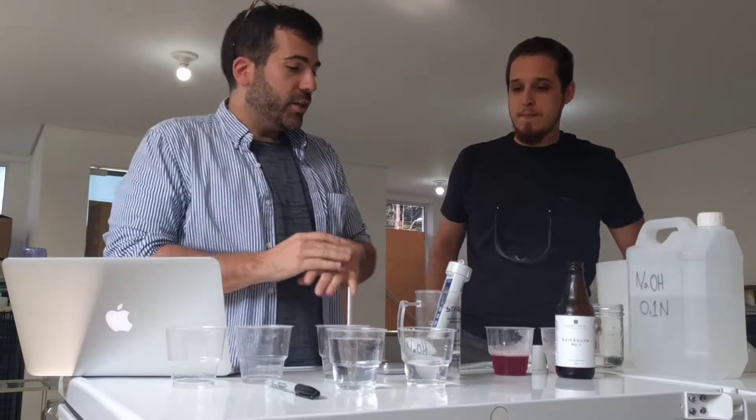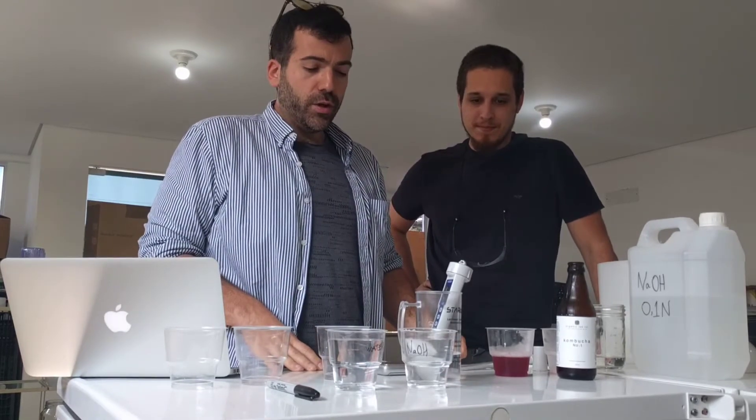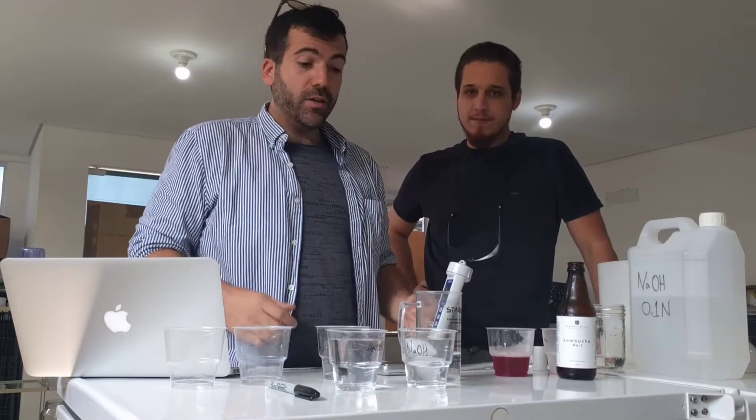A lot of people are asking me how to do a titration and there's a lot of different ways of doing it. There's a lot of inexpensive instruments you can do it with, but you can also do it kind of bootstrap style, so that's what we're gonna be doing today.